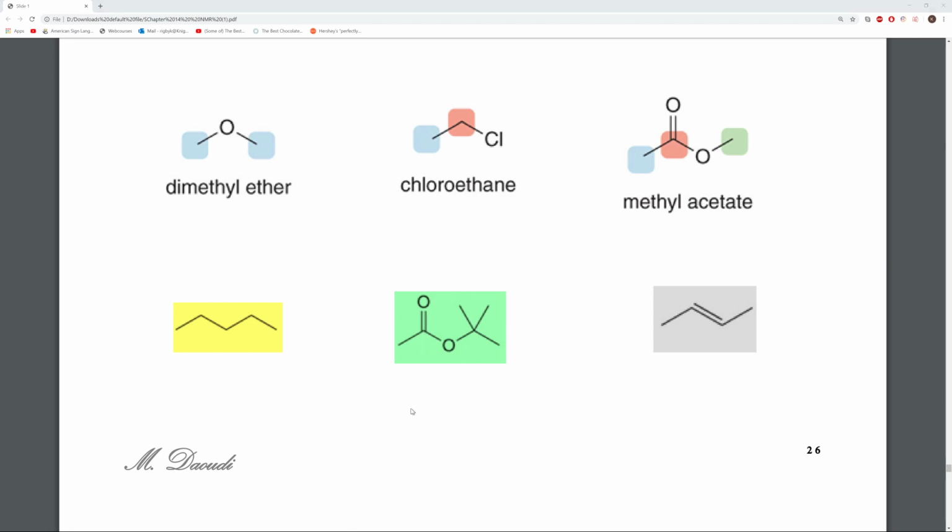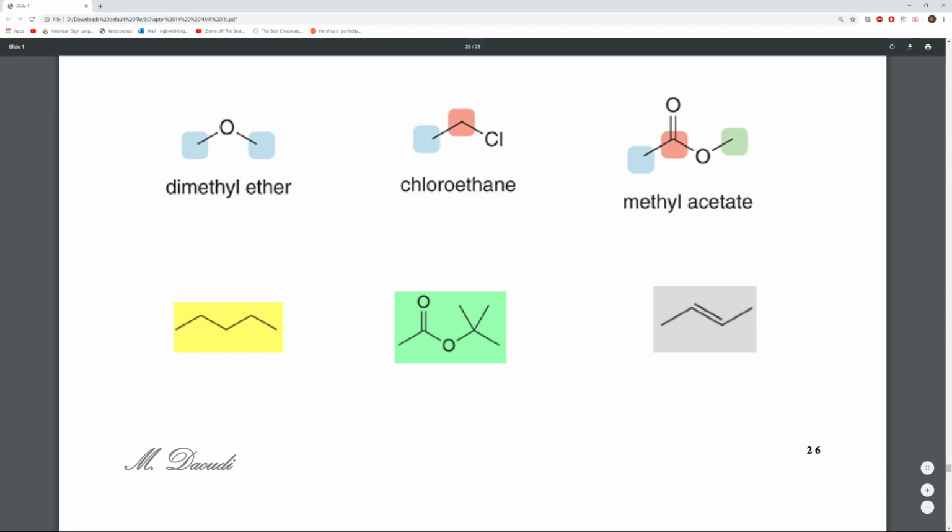Okay, so then the second example is going to have 4 different types of carbons because the carbons on the very end, making that tert butyl, all have the same type of environment because they have the same types of connections. So we only have 4 different types of carbons instead of the 6 or the 7 that we can see here. Okay?